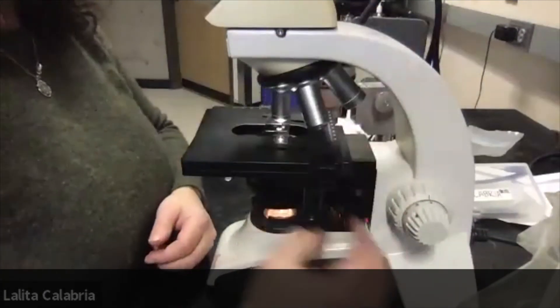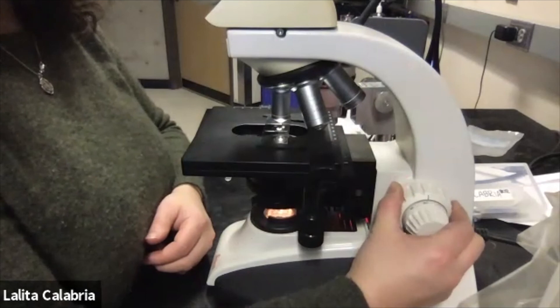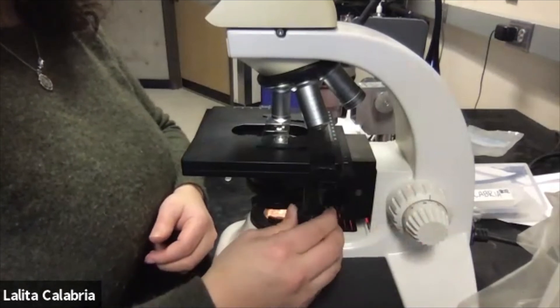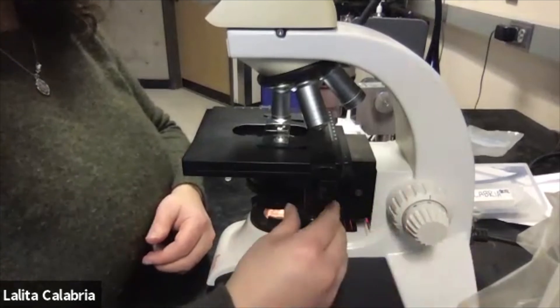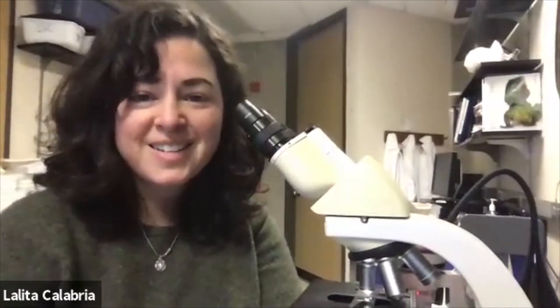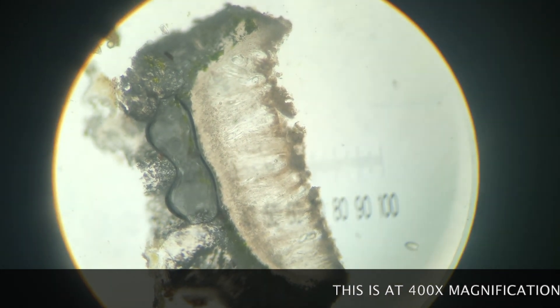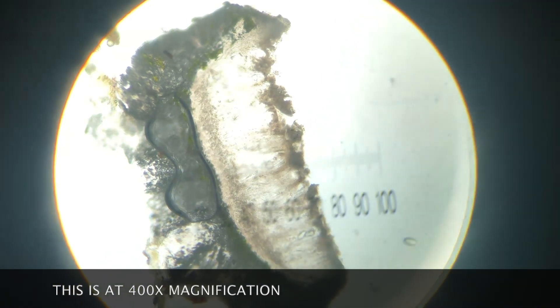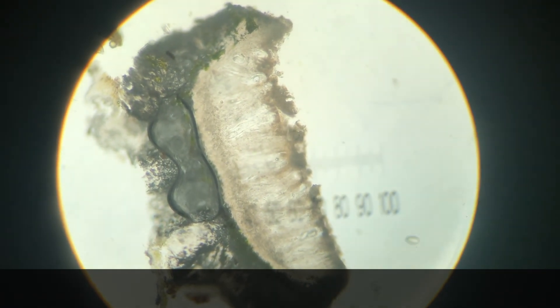For identification purposes I'm fine using 100x magnification. I can take photographs through the lens using my cell phone, which will be informative for what I need for the identification. That's a little intro to how to view spores under the compound microscope — more information about crustose lichen identification will be in upcoming videos on Canvas. Here you can see spores below the 60 mark and algae in the excipal layer surrounding the hymenium — this is what it looks like at about 400x with a pretty thin cross-section.